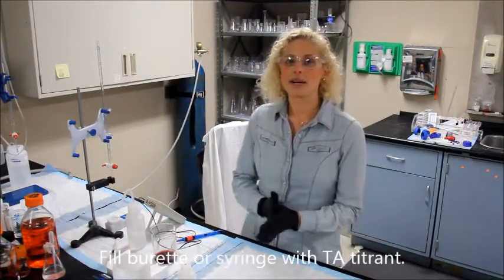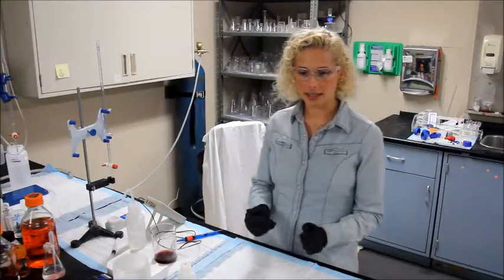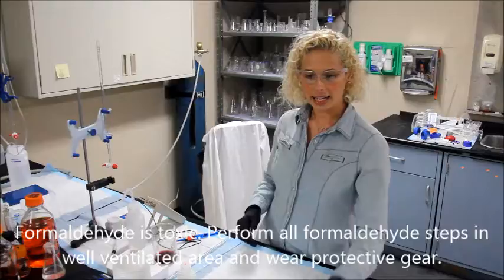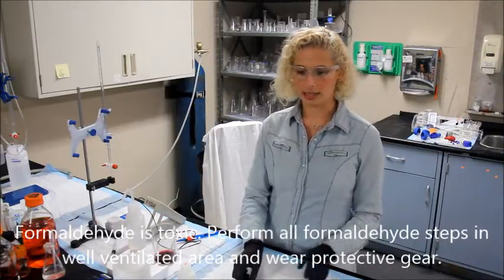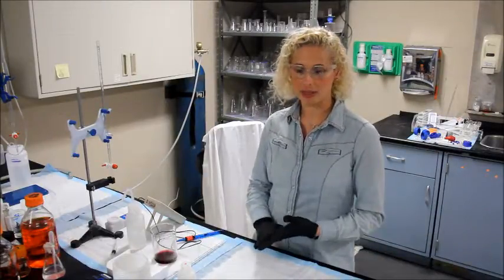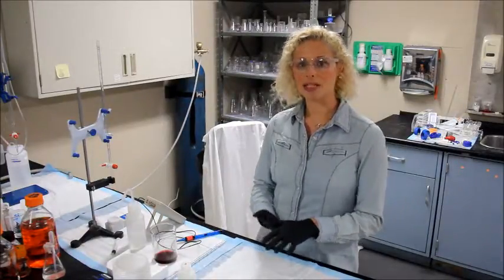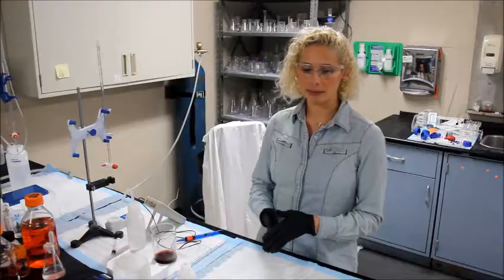The kit comes with formaldehyde, which comes in a small amber vial. It should be handled with care — you always want to use gloves, safety goggles, do not mouth pipette, keep away from open flames, and you should use it in a well-ventilated area.